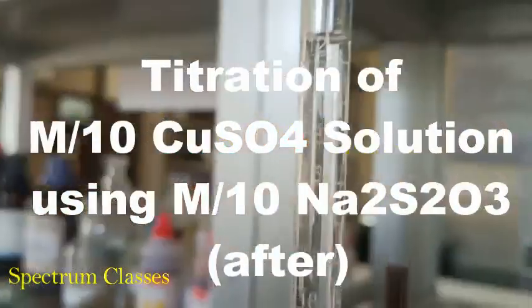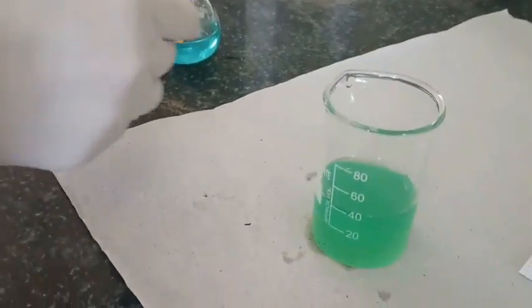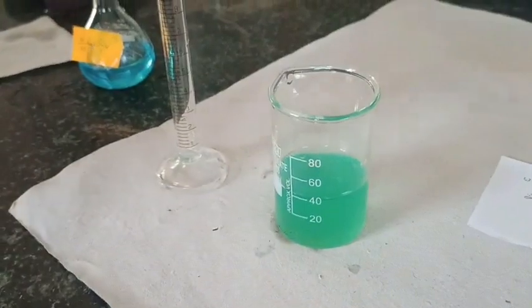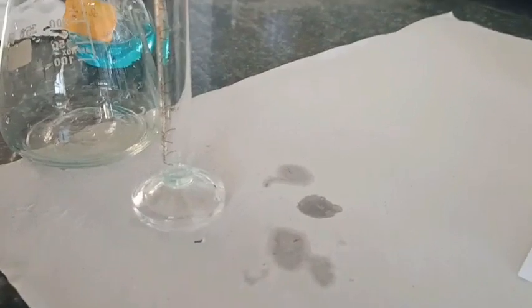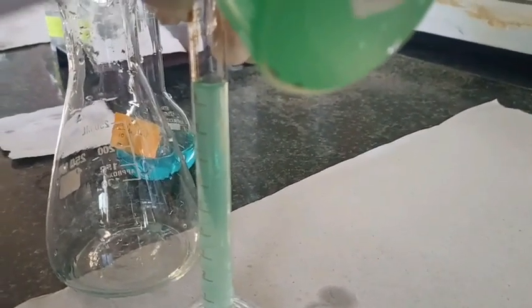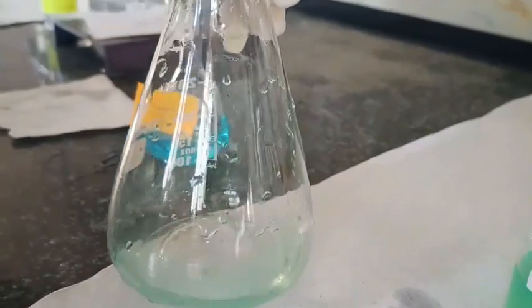Now I'm going to rinse the conical flask again with this solution, and I'm going to take 10 ml of this solution, which also has some Fe2+ ions in solution form, and the initial concentration of copper is depleted in this solution. So I'm going to titrate it again, following the same procedure.